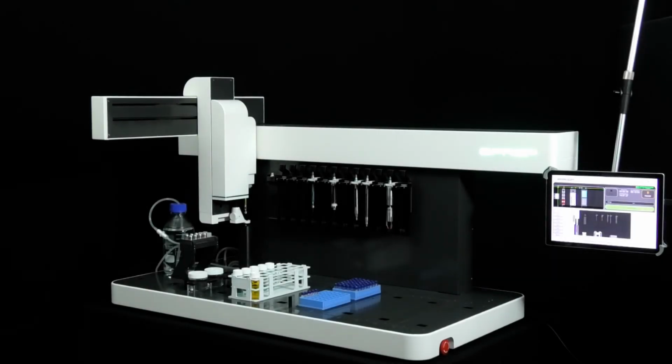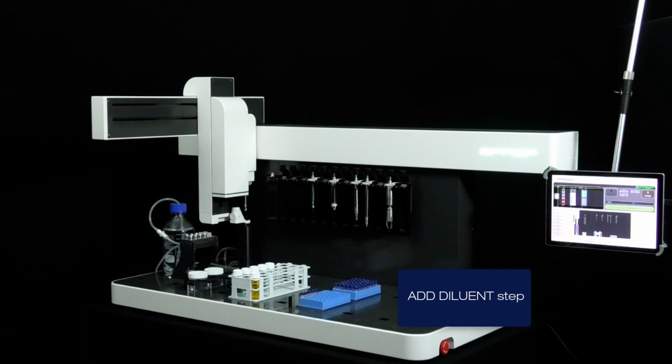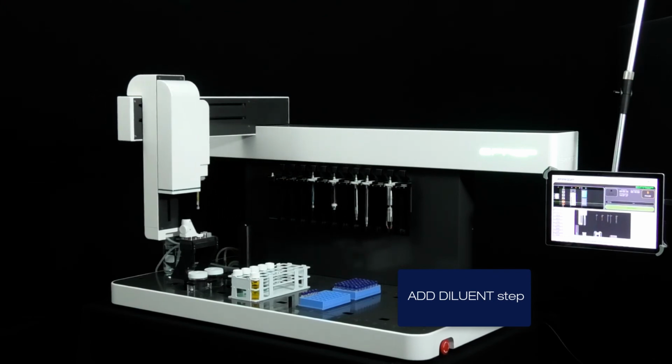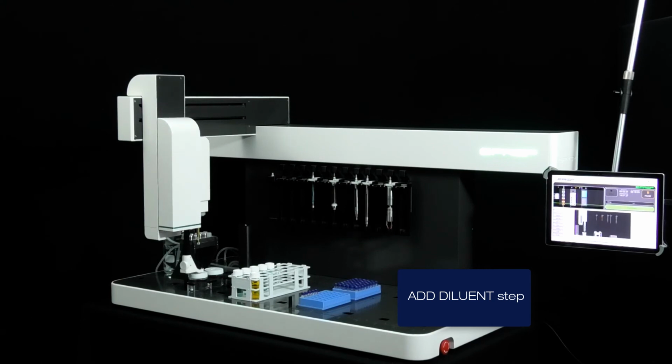We can now see the ePrep in operation. We won't see the whole workflow here because it will take too long, but I'll point out some of the steps that we'll view. We pick up the workflow near the start after the ePrep check has been completed. This check ensures all of the syringes, racks and containers on the ePrep match those specified in the software workflow.